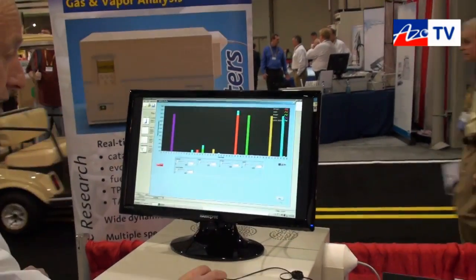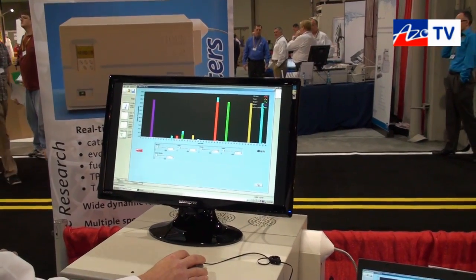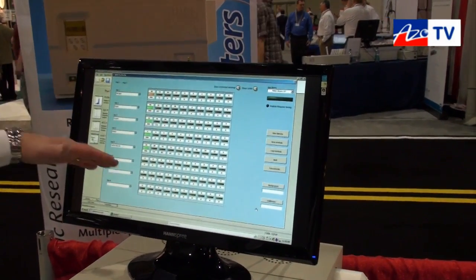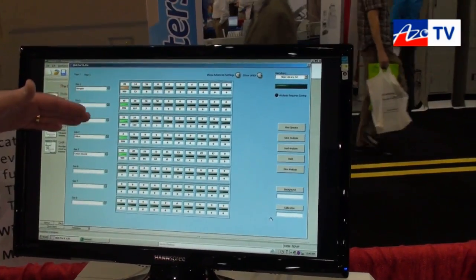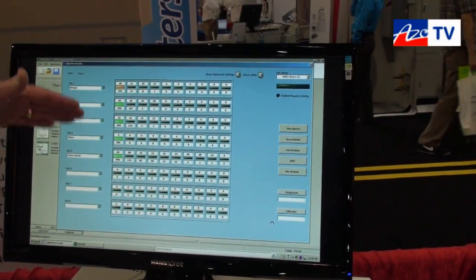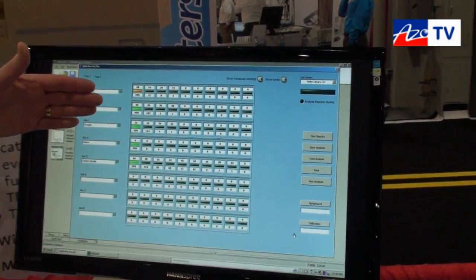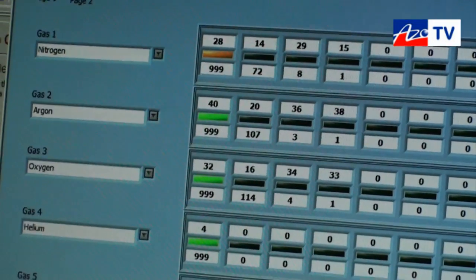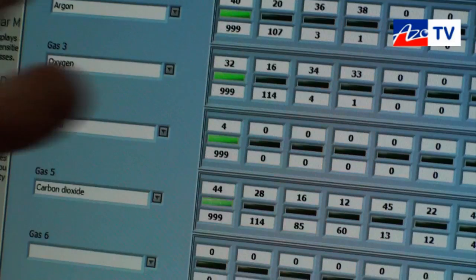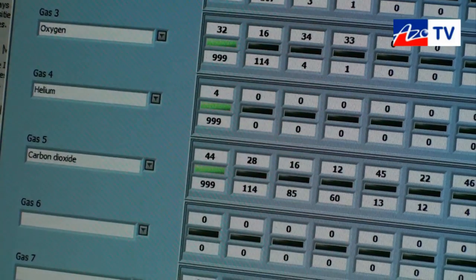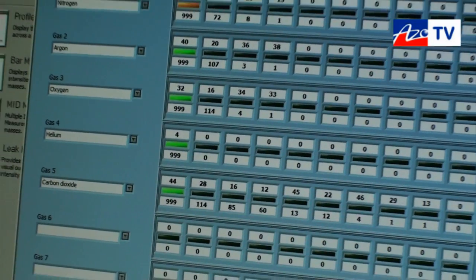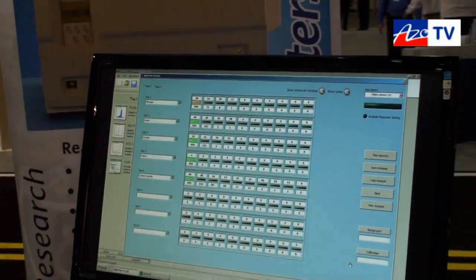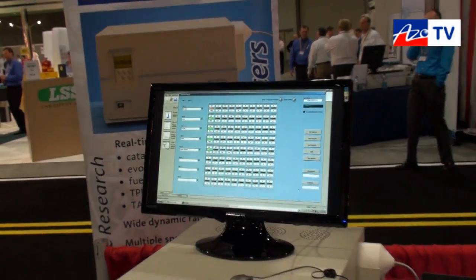Going back to the spectral overlap representation, you can see the first page of 8 gases configurable from our integral library, and we can add up to 16 gases, each with up to 10 mass spectral fragments. That is our QGA quantitative gas analysis software suite.